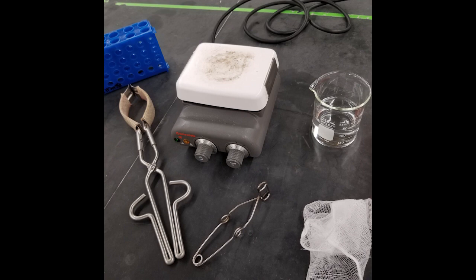The Nelson-Somogyi method is the assay you will perform in the biochemistry lab to determine the amount of reducing sugars in a particular solution.